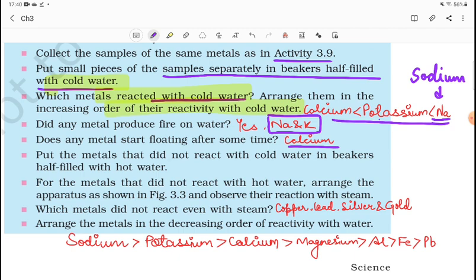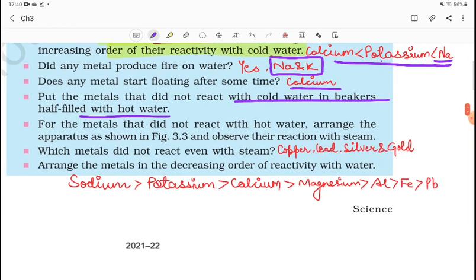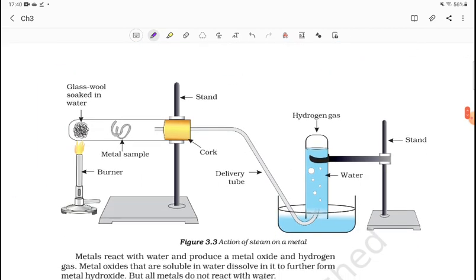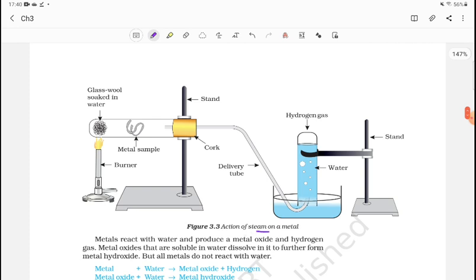Now put the metals that did not react with cold water into beakers half-filled with hot water. The 3 metals — calcium, potassium, and sodium — already reacted with cold water. The rest of the metals that did not react with cold water should be put in warm water. Which metals react with cold water? Arrange them in increasing order of reactivity.